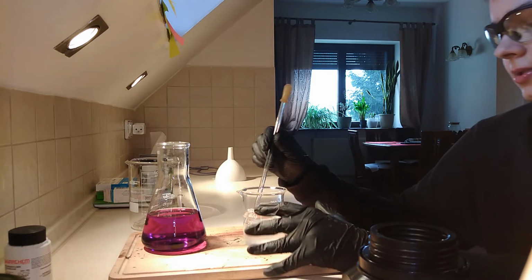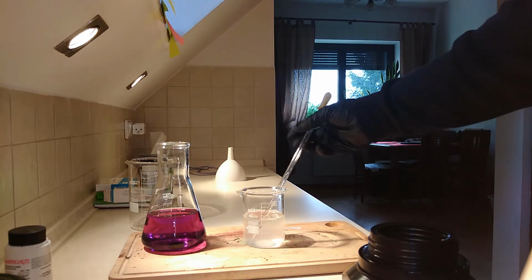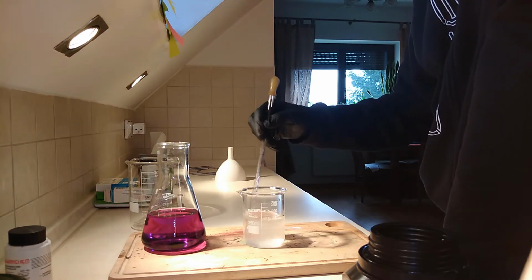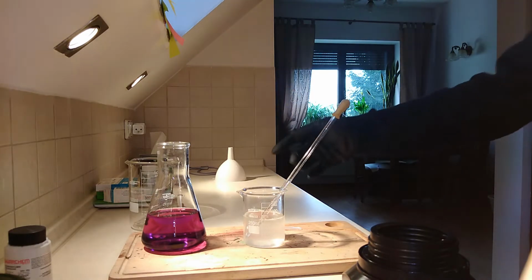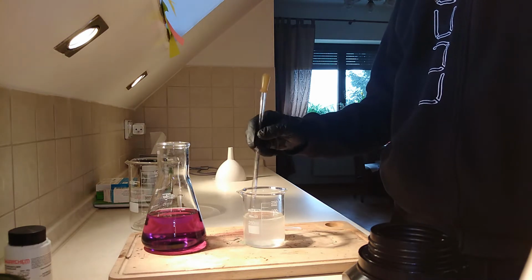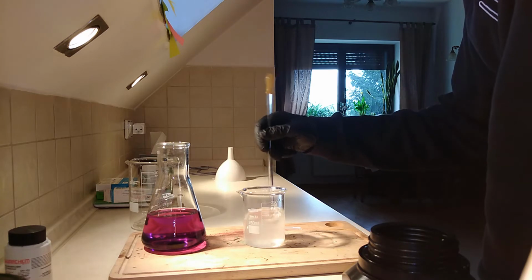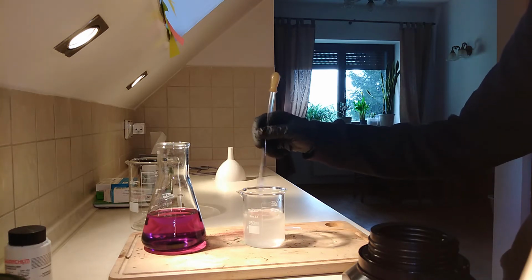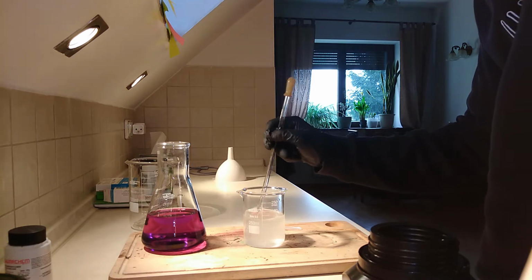The solution is quite exothermic, so it heats up quite a bit. It's not terrible, but a caustic chemical is a lot more caustic when it's hot. But it quickly cools down, so it's not an extreme problem.